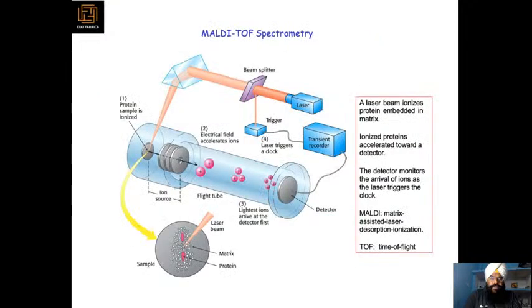Some summary results. Now after the mass spectrometry, something about MALDI-TOF. Once you've done your SDS-PAGE, you have isolated your protein in your gel. Now it's time to recognize that protein: what size is it, which protein is it, what is the structure of that protein. You can do it with the help of digestion of that protein with trypsin. Initially in the wet lab, you cut your protein into small peptides with trypsin as an enzyme, and all these peptides will run through a matrix.